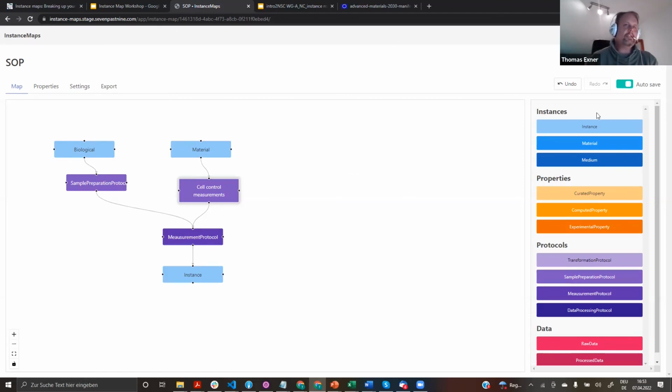The other part is that in principle everything which you do is auto-saved. Whenever you move something here, this will be saved. You can undo it. But if you now end your session, you will come into this setting directly. Therefore, you have an auto-save. This is not when you look at other people's maps. Then you do that only for yourself.